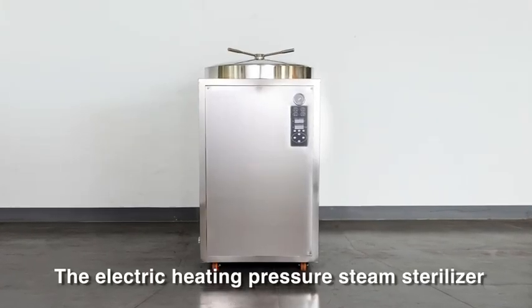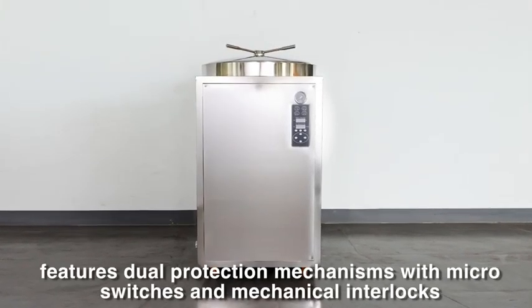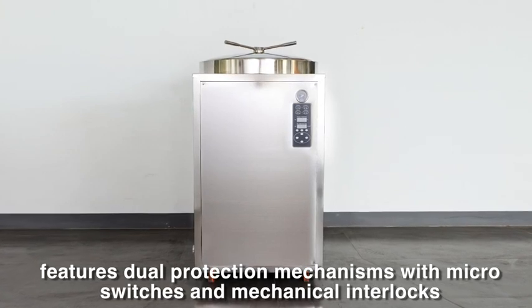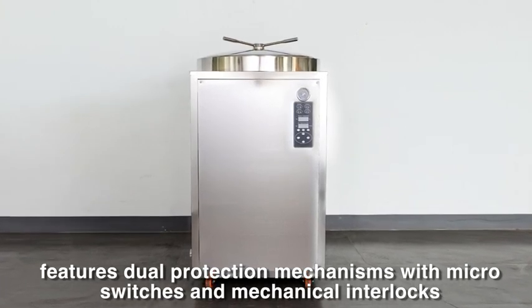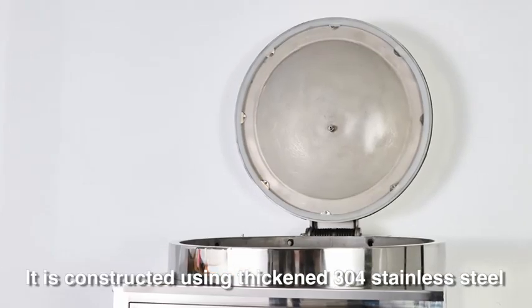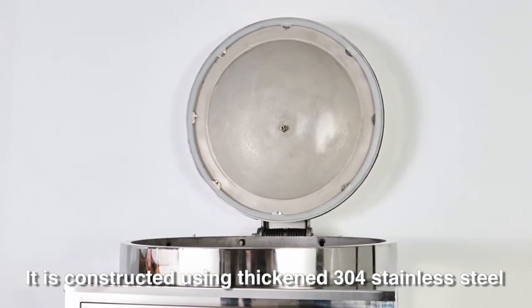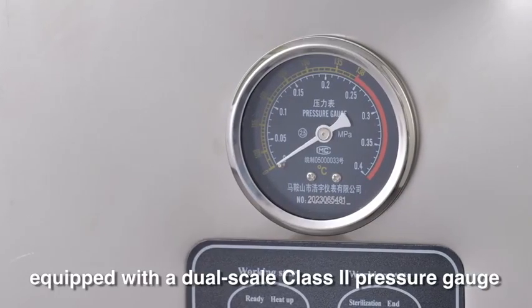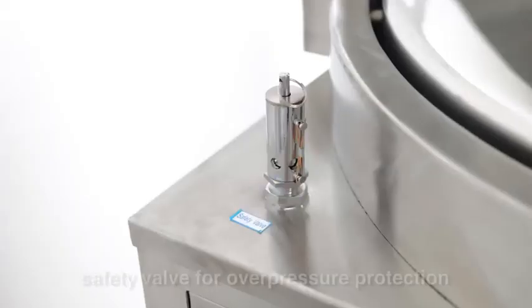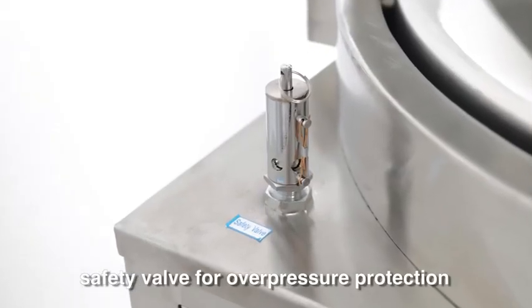The Electric Heating Pressure Steam Sterilizer features dual protection mechanisms with micro switches and mechanical interlocks. It is constructed using thickened 304 stainless steel, equipped with dual scale class 2 pressure gauge, and safety valve for overpressure protection.